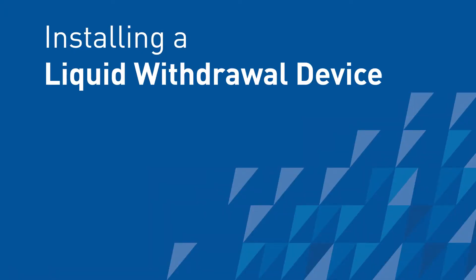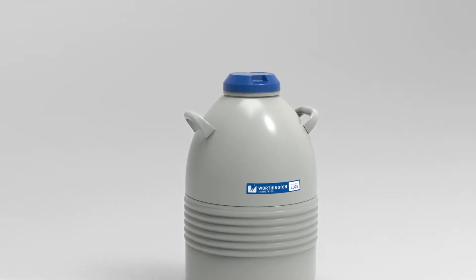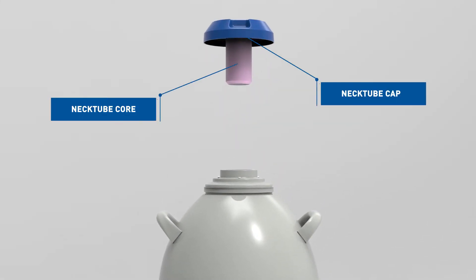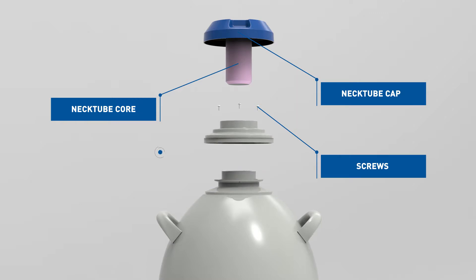Installing a liquid withdrawal device. To install, remove the neck tube cap or core from the Dewar. Remove three flat head mounting screws in the base of the plastic trim collar around the neck of the Dewar. Remove the collar and discard or save for later — it is not used while the liquid withdrawal device is installed.